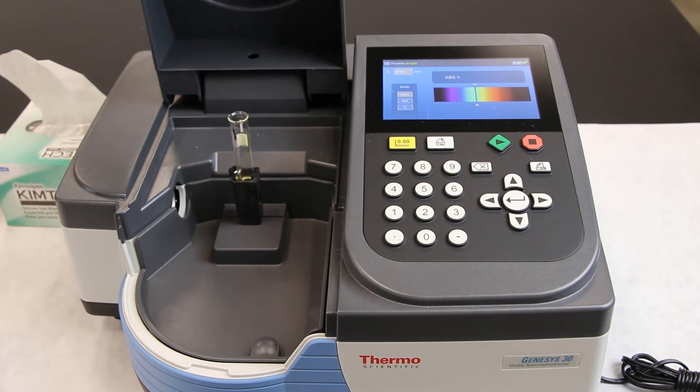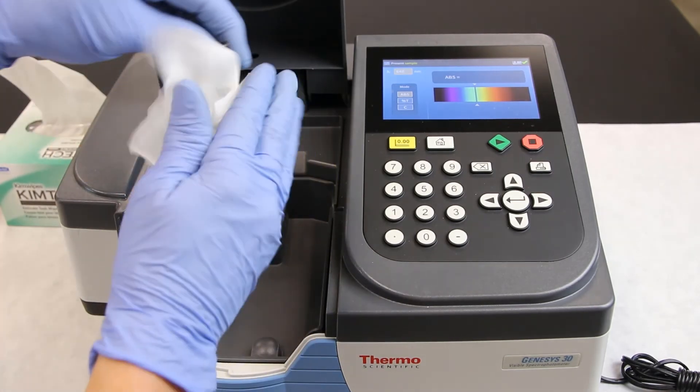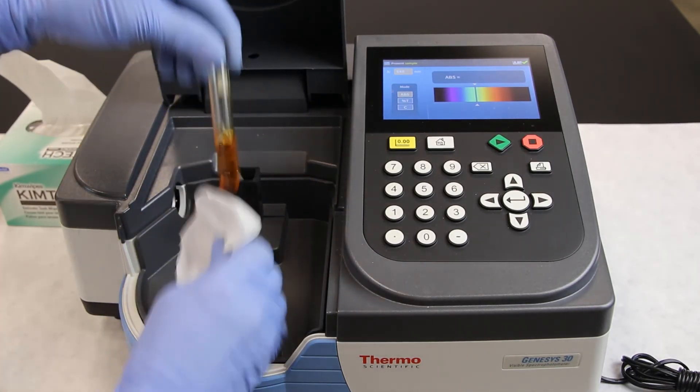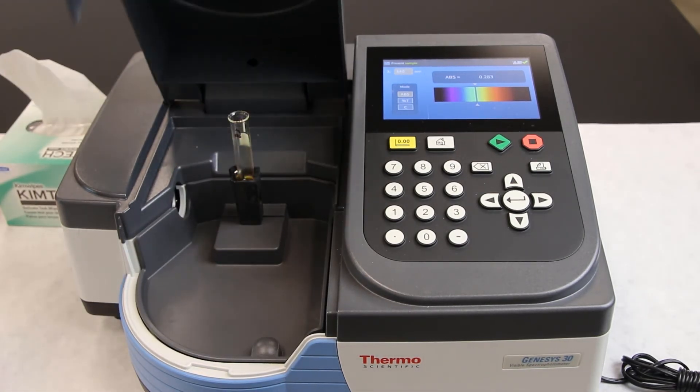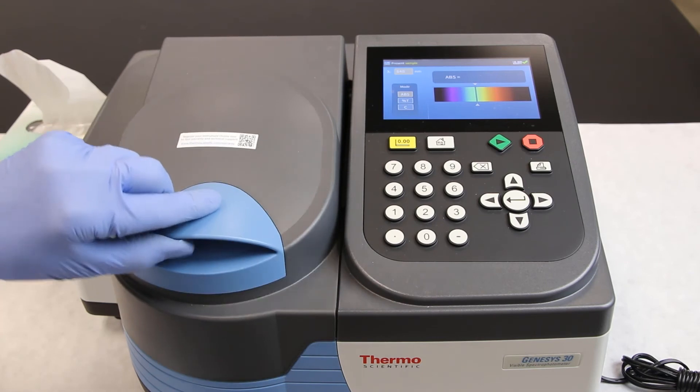Now it's time to read cuvette number 2. Wipe down the tube, place in cuvette chamber, and close the cover. Read the number on the display. Record the absorbance. Repeat this with each temperature sample.